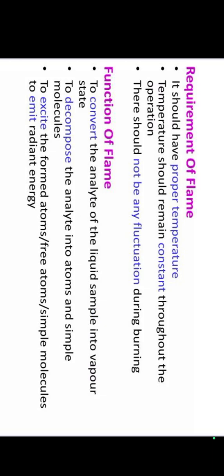Next, the requirements of the flame. We need the proper temperature. The temperature must remain constant, without any fluctuation while the burner is burning. Next, the functions of the flame.